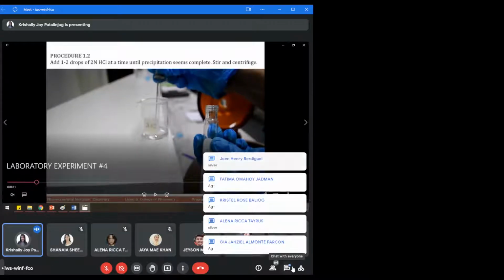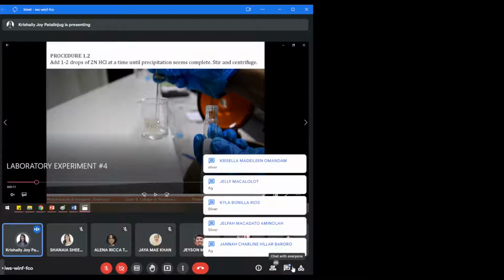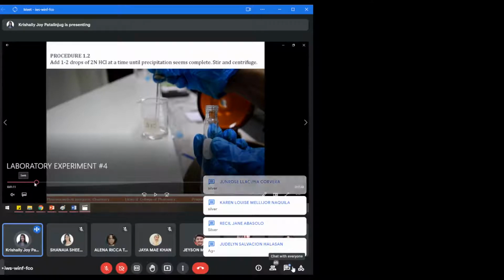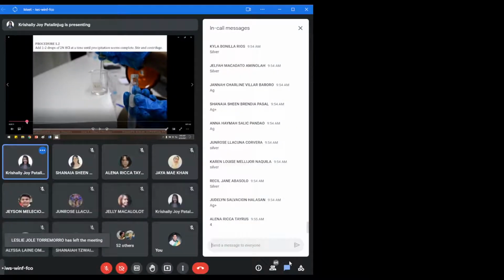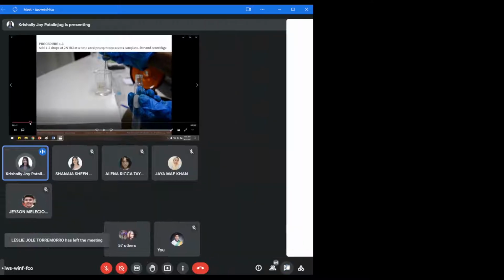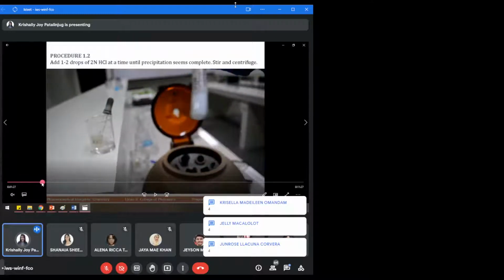When you identify an ion you have to write its formula as Ag+, the ion form, because the question asked for the ion. Remember, an ion is a charged atom. So silver precipitates out. How many remain? 4 only: copper, zinc, barium, and sodium. So that is the concept.